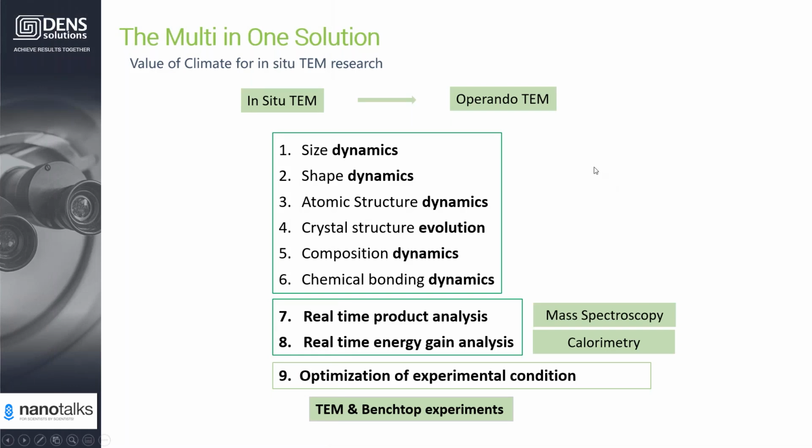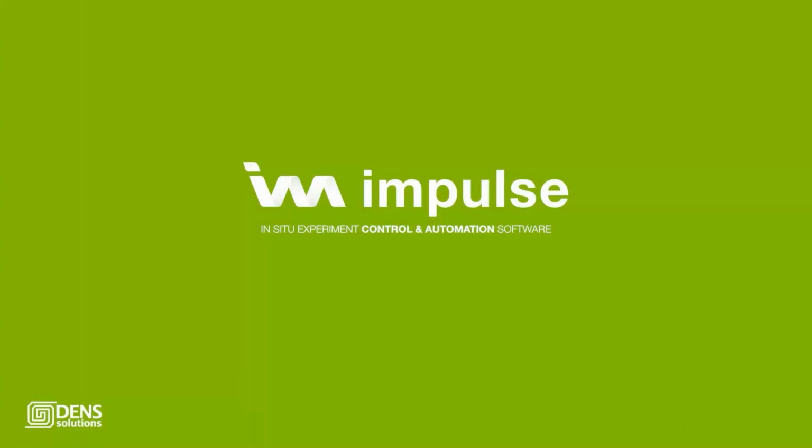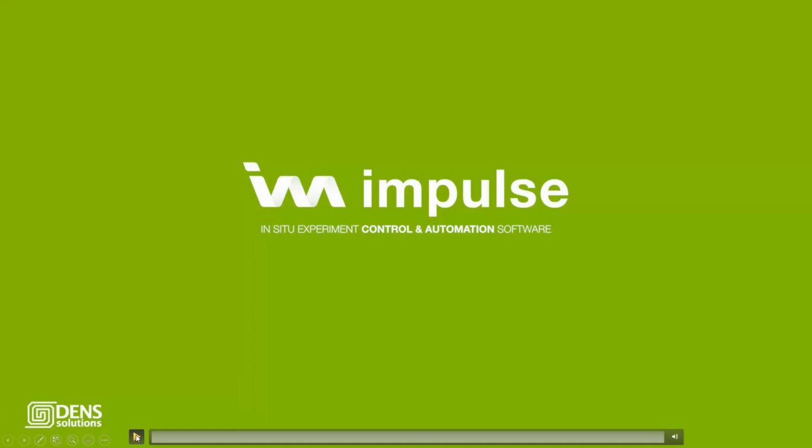Here is a summary of what we can do with the climate gas and heating system. You can do in situ and operando. And you can also optimize your experiments on the benchtop setup before you move to the TEM. Next, I will show you a practical view. In the former slides, I showed a lot of schematic and conceptual views, while practically, how do we realize it? Here is a video from the Impulse introduction video.